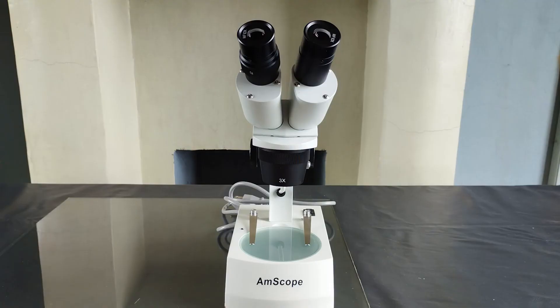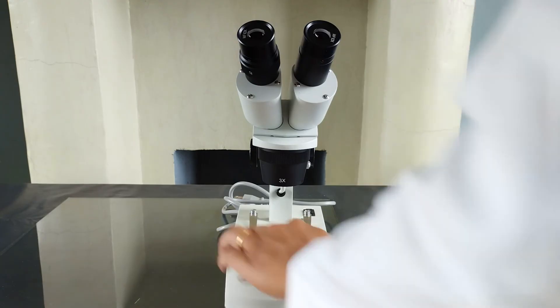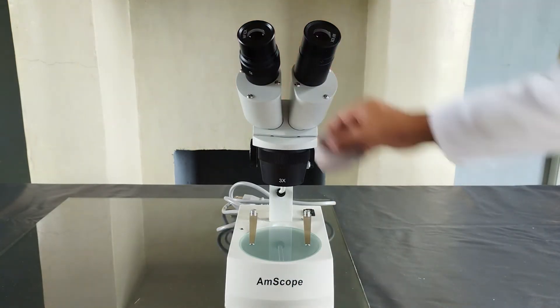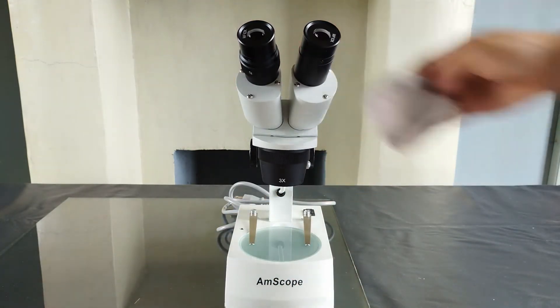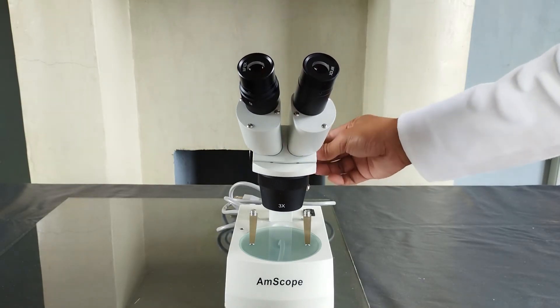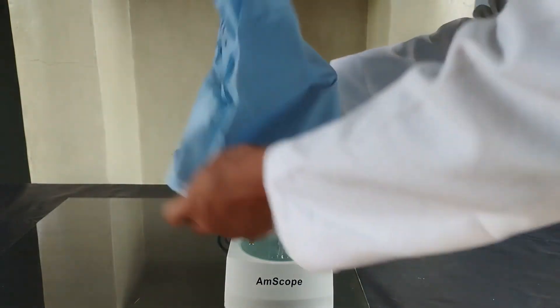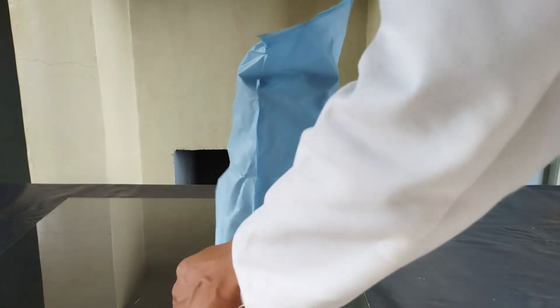When you're done using the microscope, remove the specimen from the stage, clean the eyepieces, the stage, and the body of the microscope using a clean lens cloth or paper. Lower the body tube of the microscope to its maximum by turning the adjustment screw. Finally, either cover the microscope with its cover or return it back to its designated box.